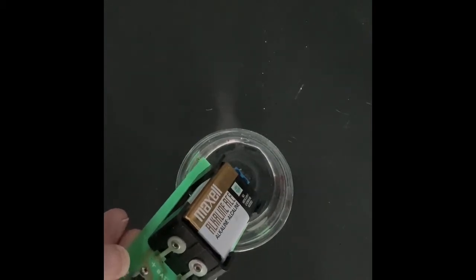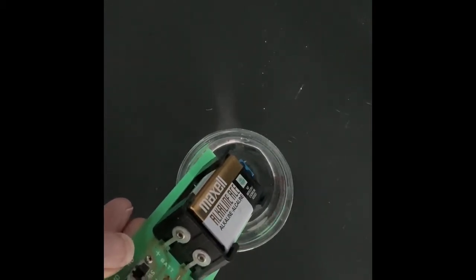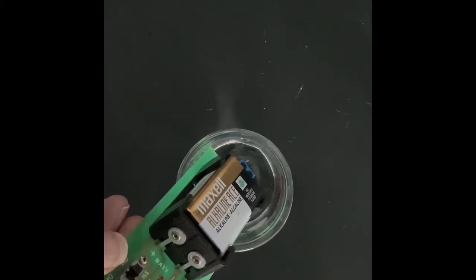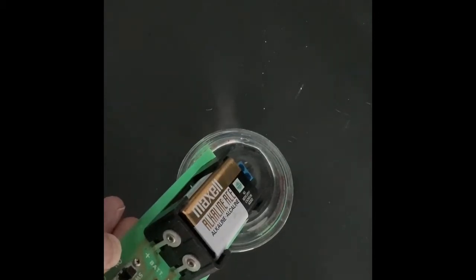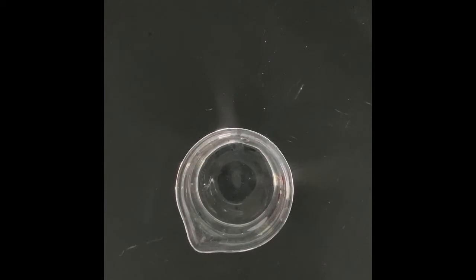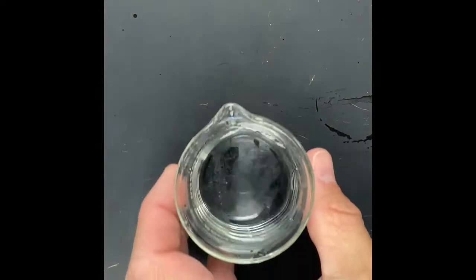And kind of like the wax, you're gonna notice just a titch of red. The green is, for all intents and purposes, non-existent, not lit up at all. All right. So again, make those observations. Obviously, you can replay this video if you need to see everything for conductivity. Woohoo! All right, everyone, we are now going to do solubility.